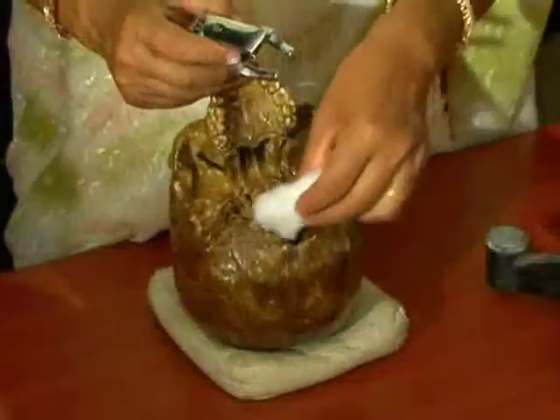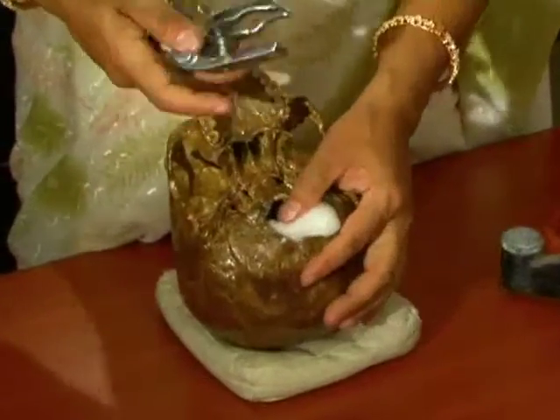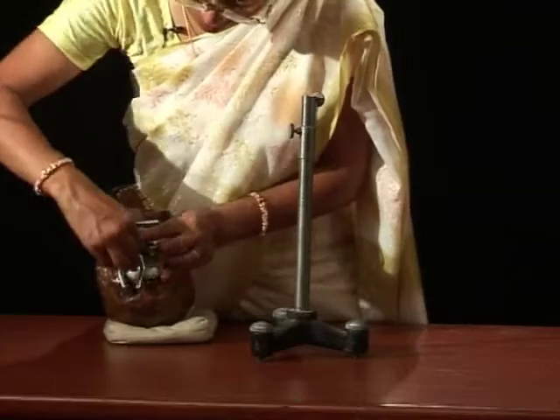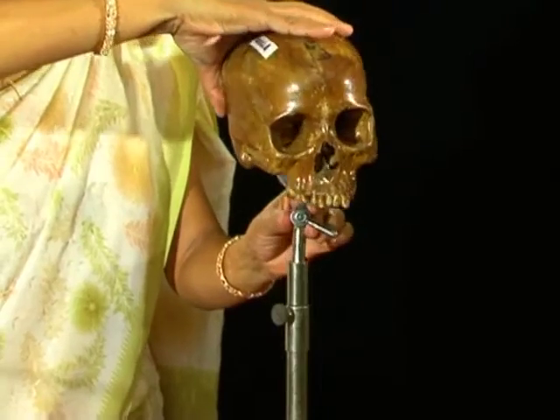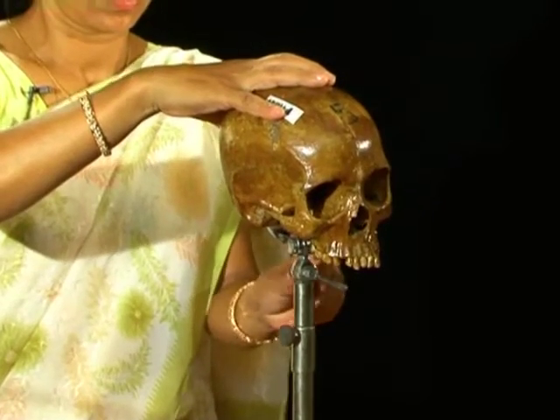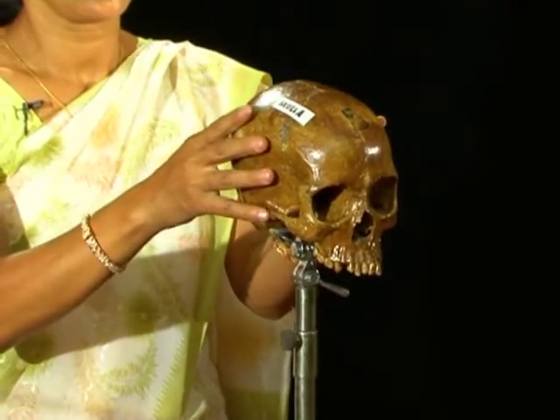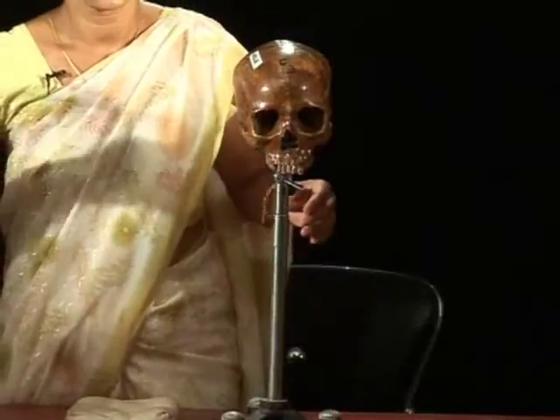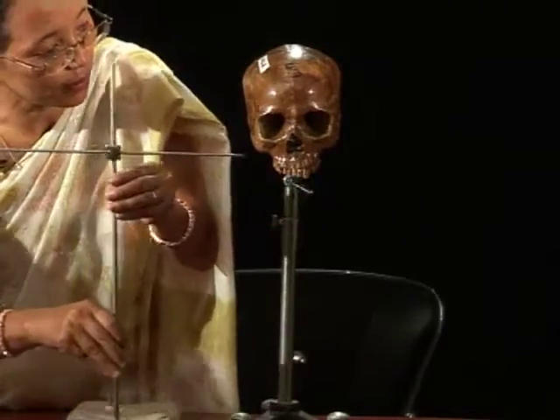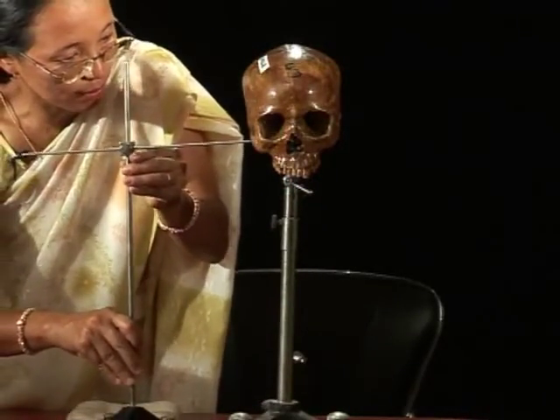Manipulation. The instrument is first placed on a leveled plane. The skull is then mounted at the foramen magnum on the adjustable jaw-like structure, otherwise known as the skull holder. With the help of the horizontal needle of Martin, the skull so mounted is placed in a FH plane.